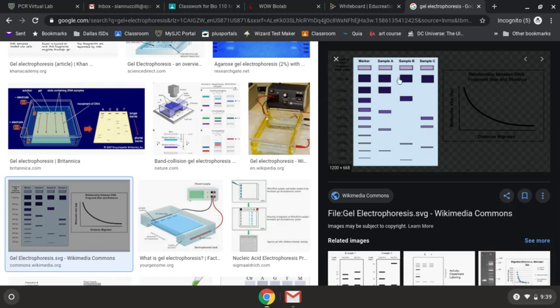All of them are in the same spot because they all have the same amount of letters. It doesn't matter what the letters are. Just because the letters are the same amounts, they're going to stop at that point. Same thing here. Let's say this is 15 letters long. These two pieces don't have 15 letter long sequences or pieces, and we know that because there's no band here.